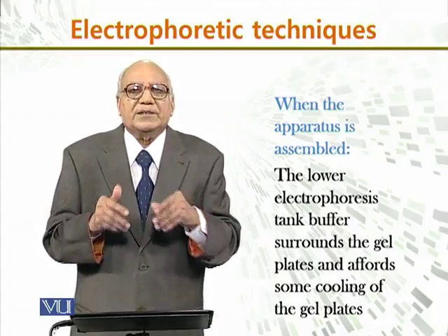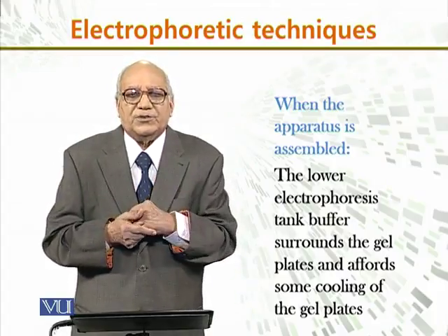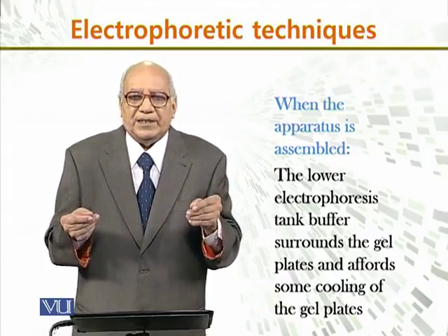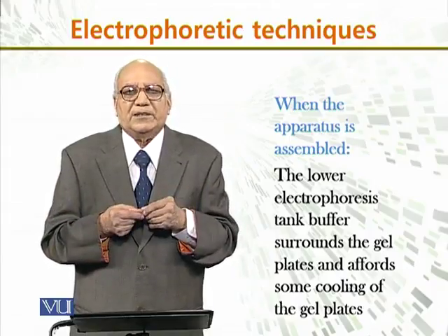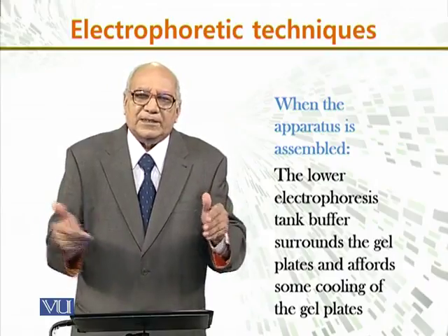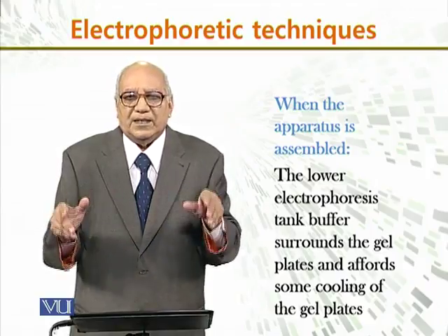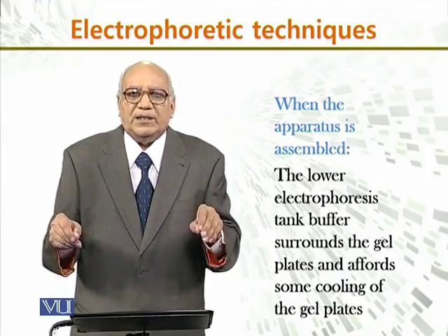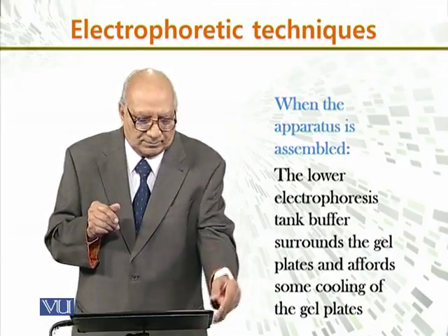Now, when the apparatus is assembled, the lower electrophoresis tank buffer surrounds the gel plate and affords some cooling of the gel plates, because the buffer acts as a connection between the power supply and the gel, and at the same time it helps to cool the gel plates.